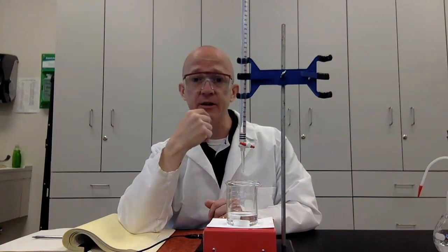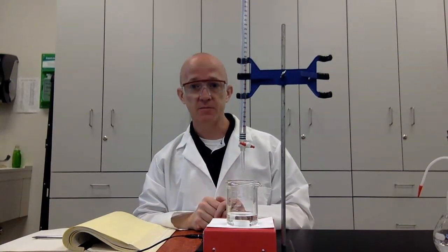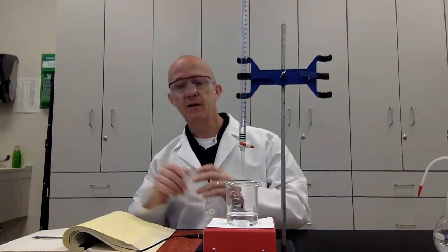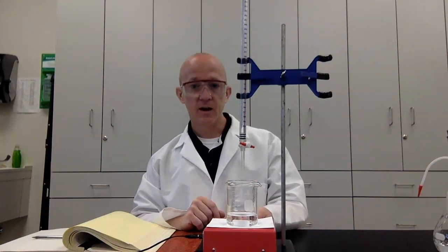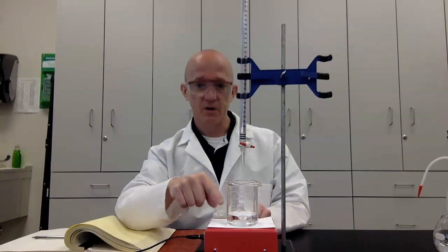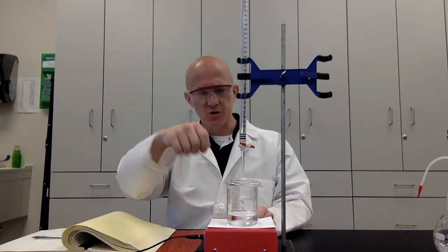So the idea here is once we cross over into basic land from acidic land, that's going to change color for us. I can stop adding NaOH at that point, and I can figure out exactly how much volume I've used, and then determine the molarity of this unknown acid. You ready? Hey, this is pretty cool. This is my magnetic stirrer. So when I turn this on, there's this little magnetic bar in there. You can see it spinning, and as it spins, it allows it to be mixed very well. I don't have to sit and shake the beaker or stir it or anything like that.